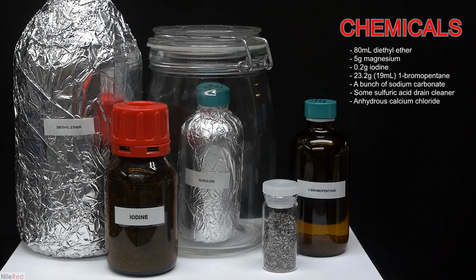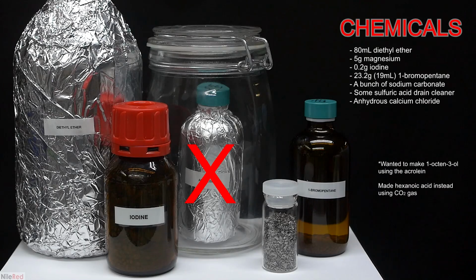This is the original shot that I took to show the chemicals that I needed before I knew that my acrolein had polymerized. Instead of acrolein, I use CO2, so I'm just going to cross off this bottle of acrolein, and we'll imagine it being replaced with a little bit of sulfuric acid and sodium carbonate.